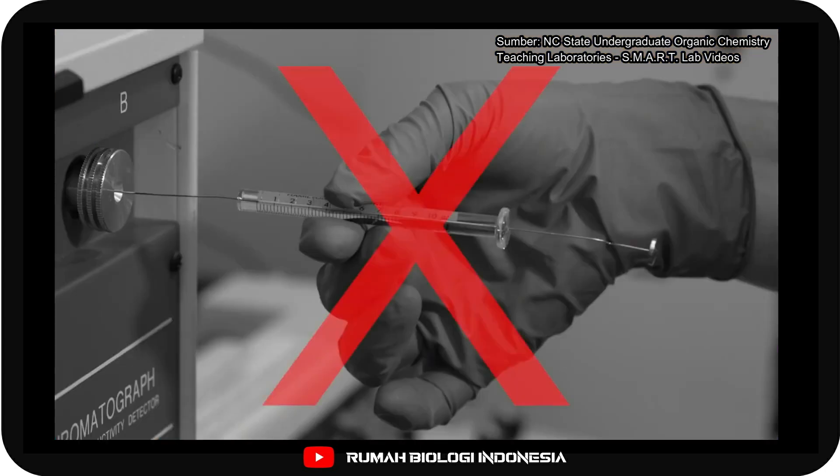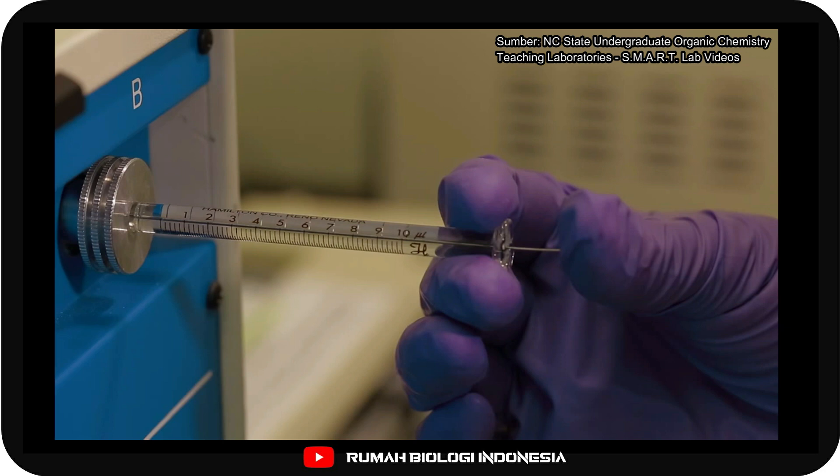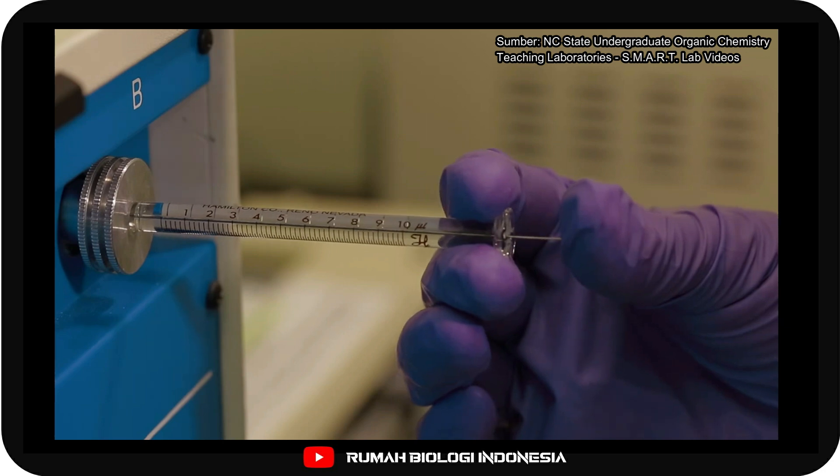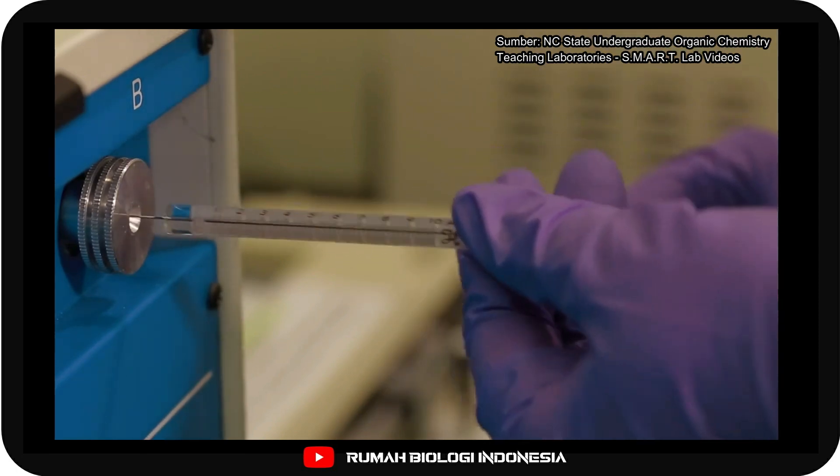Be careful not to bend the syringe. You can now inject your sample into the gas chromatograph. When you inject your sample, make sure to promptly plunge the syringe without bending it. It is necessary to ensure that the entirety of the sample is injected at one time.